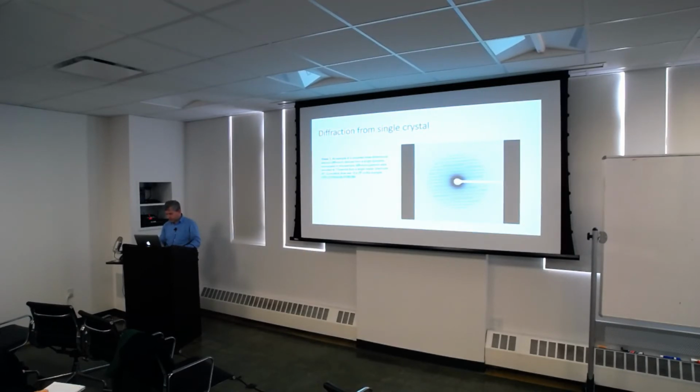Oh, and here's a movie from this first set, which was taken at 1 degree increments, and then the diffraction spots are circled. Yeah, you can see some of them, but not very many. These are the ones that were found by the software. They actually solved the structure of it. Yeah, this went to 2.9.